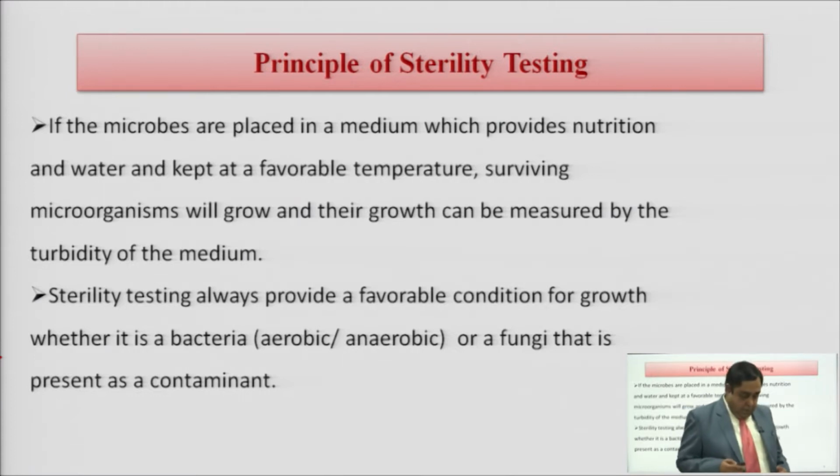Therefore, what we have to do is take the medium, one for aerobic bacteria, another for anaerobic bacteria, and the third one for fungi. And then after carrying out this test, we have to expose the sample to that particular bacteriological or fungal media to see whether the organisms have survived.